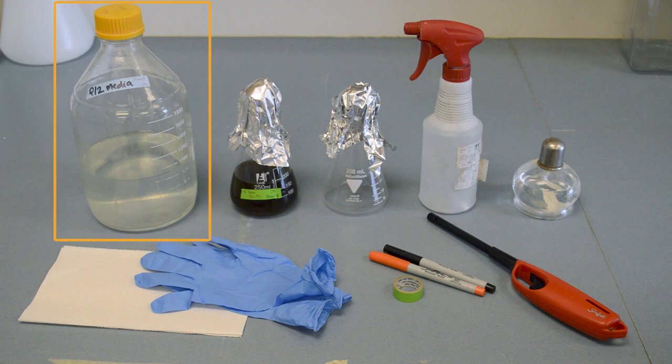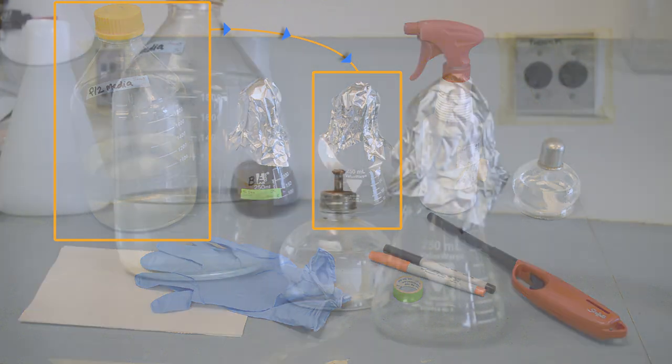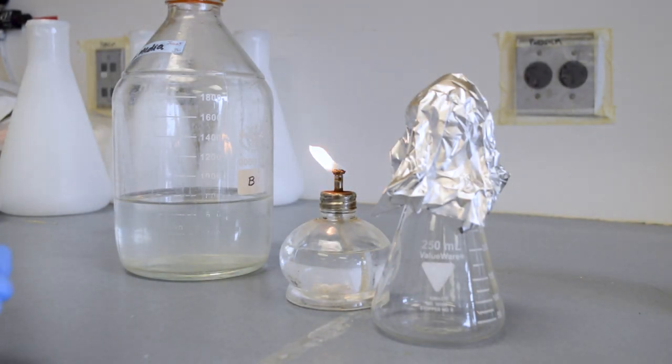Next we're going to add sterile media to our new flask. We're using F2 here. If you have sterilized your media inside your new flask, you have already done this step. Start by loosening the cap on your media bottle.